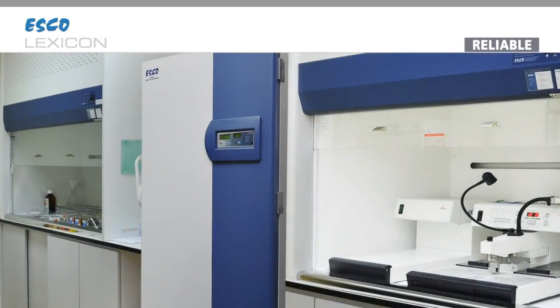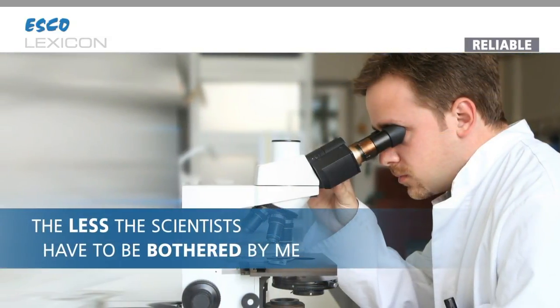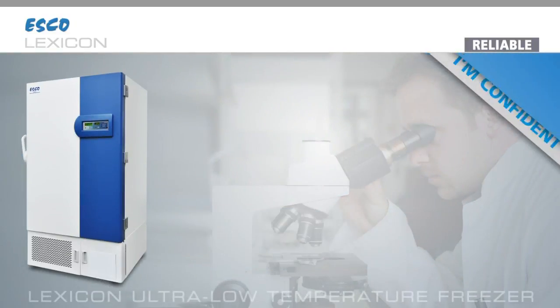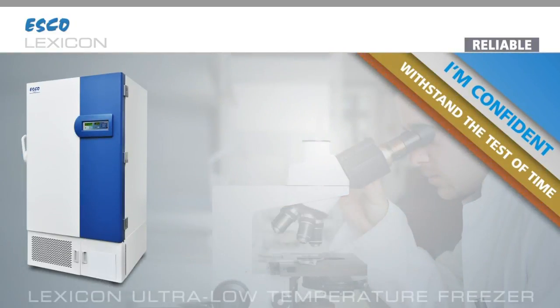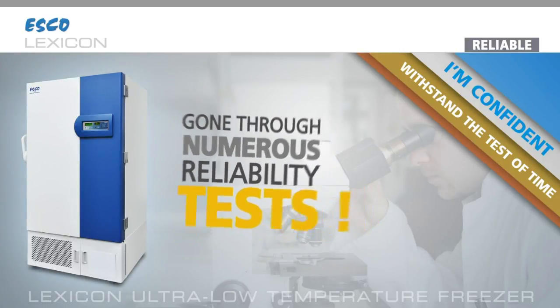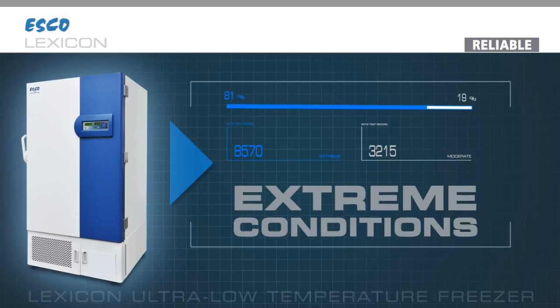Reliable. As a freezer, I know my place in the lab is not the center stage. The less the scientists have to be bothered by me, the more reliable the freezer I am. I'm confident that I could withstand the test of time, as I have gone through numerous reliability tests during the design phase. All my key components have been stress tested and thoughtfully chosen to withstand heavy use in extreme conditions.